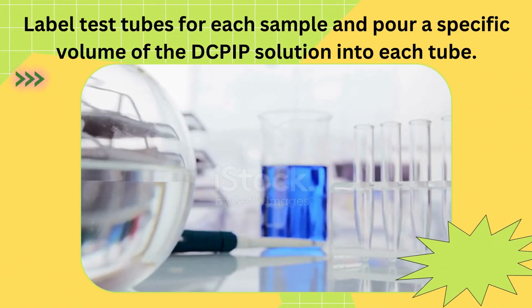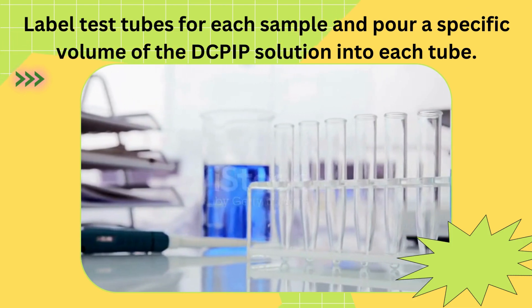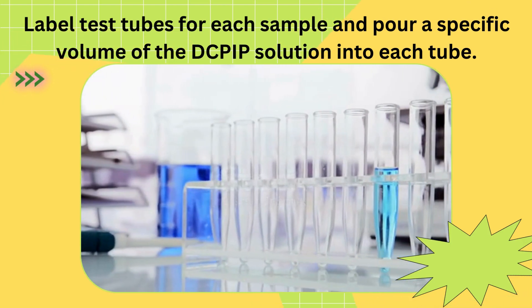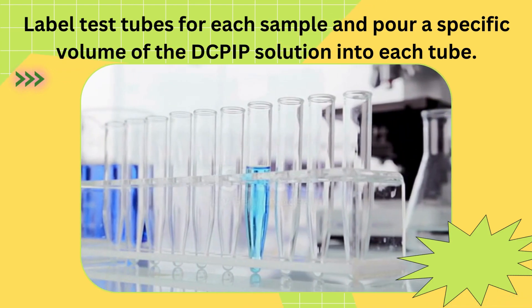Now, let's label test tubes for each sample and pour a specific volume of the DCPIP solution into each tube. Remember, use a consistent volume for accurate comparisons.